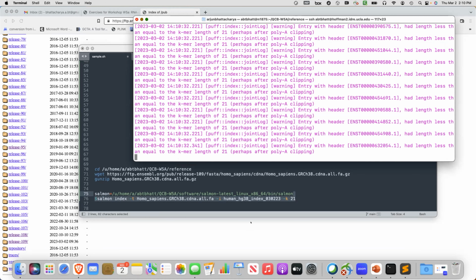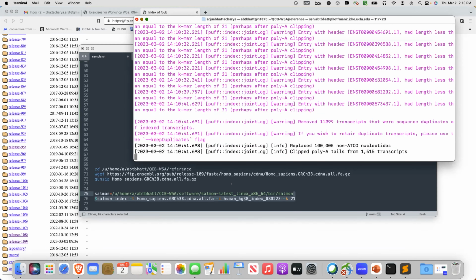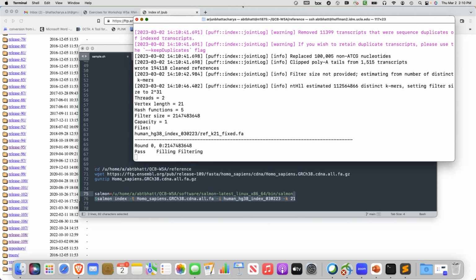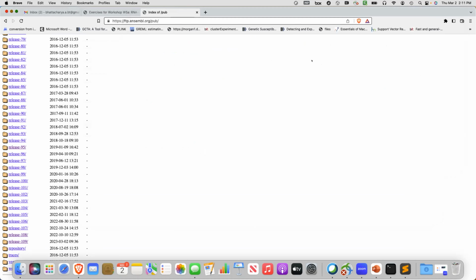Everyone, try to give me a thumbs up, or just stop me if you are getting errors, but this should be pretty straightforward. So I'll give you, I think, 2 minutes, in case there are any errors, and if not, we'll start. We can talk about what this K parameter here is.